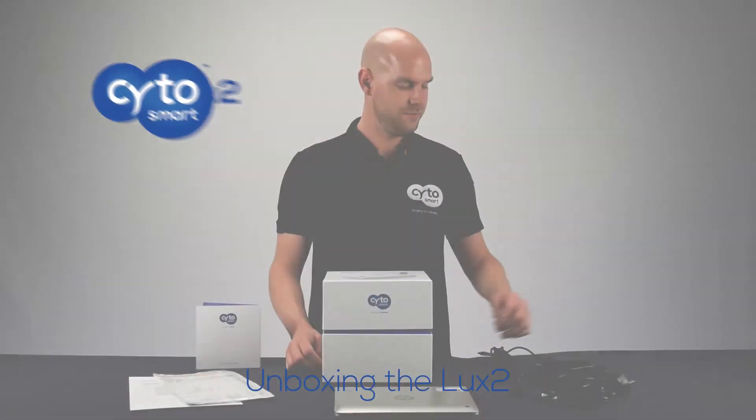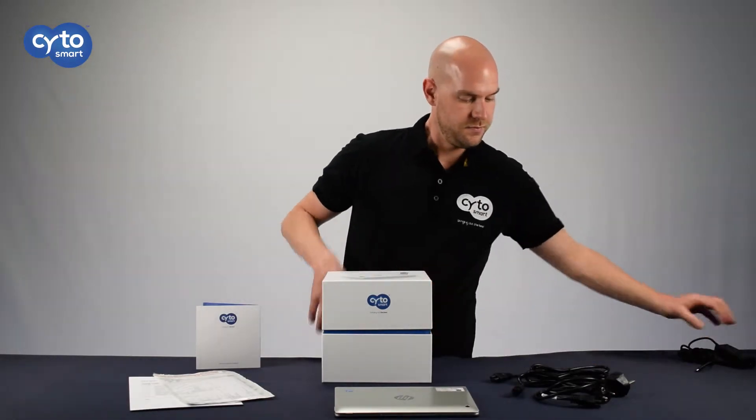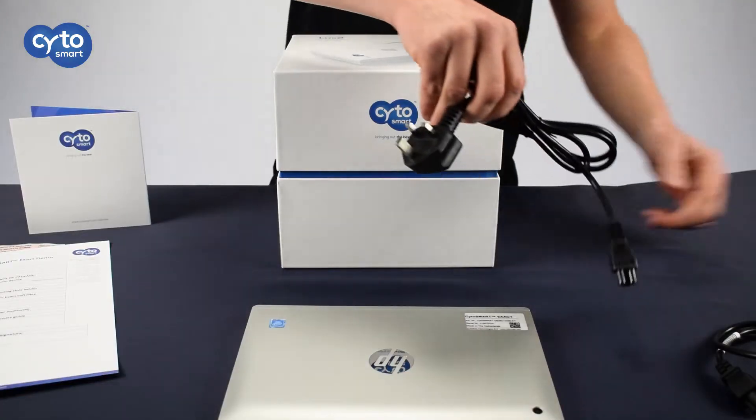In the shipping box, you'll find the power adapter for the tablet along with the appropriate cable for your region. We will ensure that you have the perfect adapter for your region.